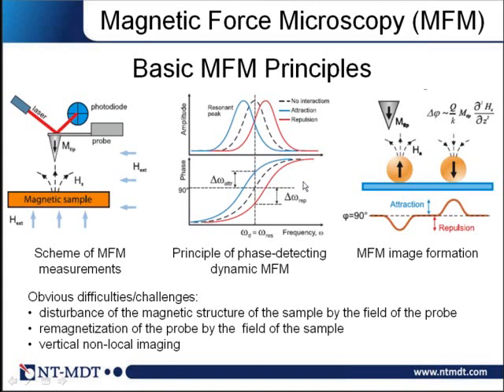There's again a question whether it's possible to apply a magnetic field during heating. Well, in general, it's a strong challenge, because the permanent magnets which are usually used survive up to 100 C. So if you're talking about heating of 20, 30 C above the ambient temperature, just up to 60 or 80 degrees, these magnets can be easily used.